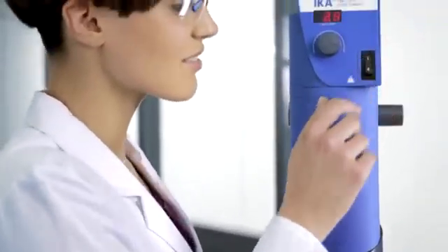The ancient art of rotor stator dispersing technology. IKA Ultra Turrax: powerful, reliable and versatile.